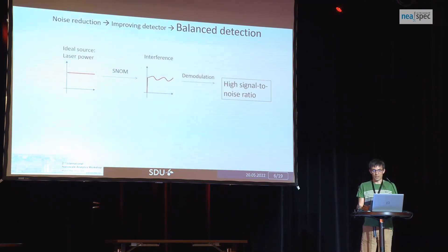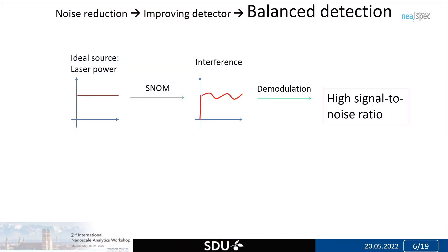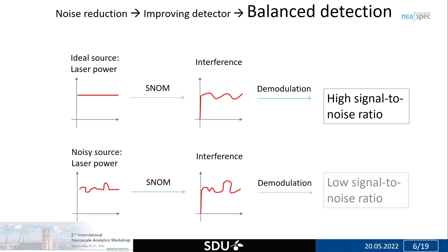The final tip about detection is a bit more complicated, but if you use it right you will gain really a lot, because it will help reduce noise from the source. If you have an ideal source, it has constant power. Put this source into the SNOM, and at the output there will be some modulation by interference because of SNOM. The system does demodulation and you get a high signal-to-noise ratio. But that's not always the case — there is always some noise in the source. Some sources are approved by Neospec; some have larger noise. When there is a noisy source, this noise sums up to the detection and goes into the interference pattern, so after demodulation you will get a low signal-to-noise ratio.